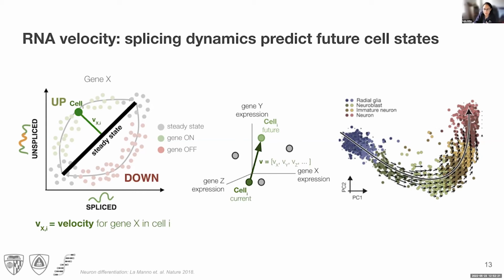There are a few different things that you can do with this RNA velocity analysis, and this includes determining which genes are exhibiting significantly dynamic behavior, and which genes have differential dynamics between cell types. But to get an overall sense of the dominant trajectories in a single cell population, we still really rely on looking at the population in reduced dimensions and projecting the RNA velocity vectors onto this two-dimensional representation, as I'm showing here with this neuron development data.